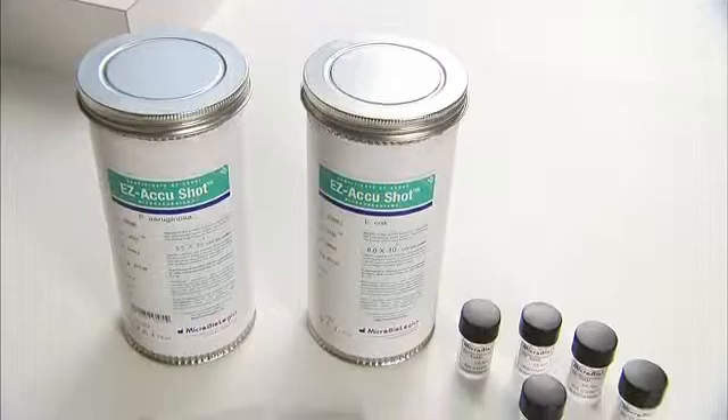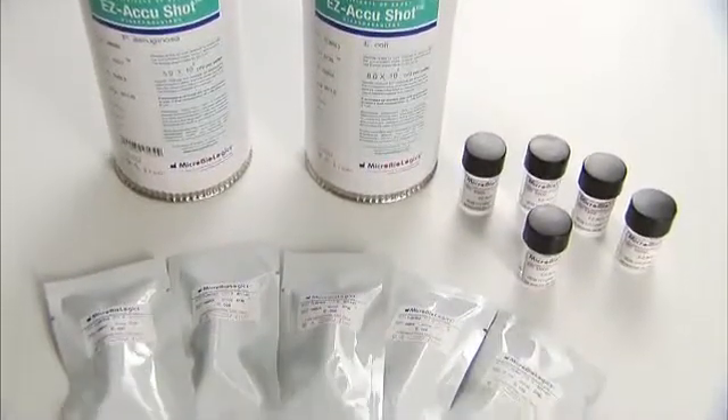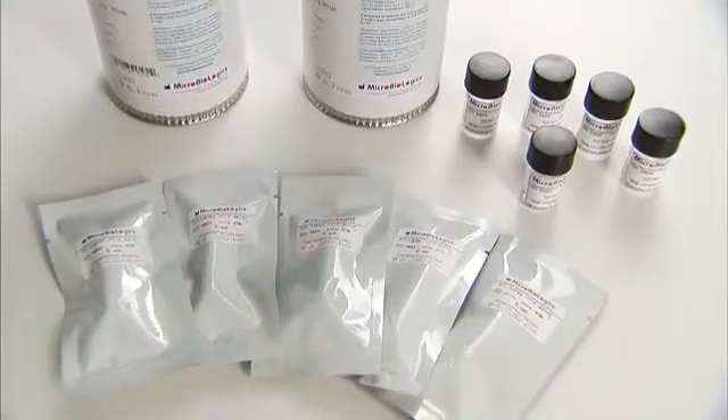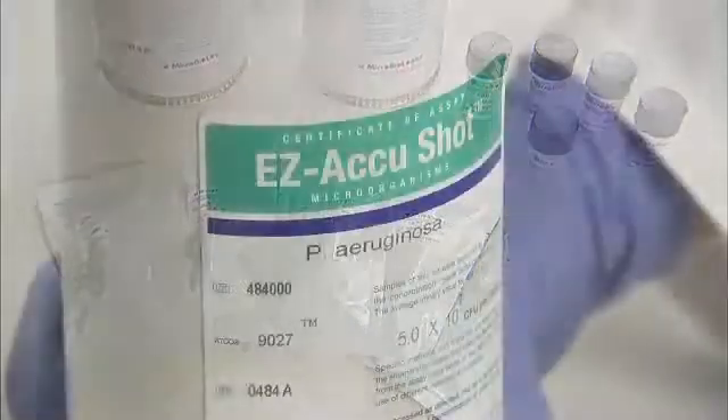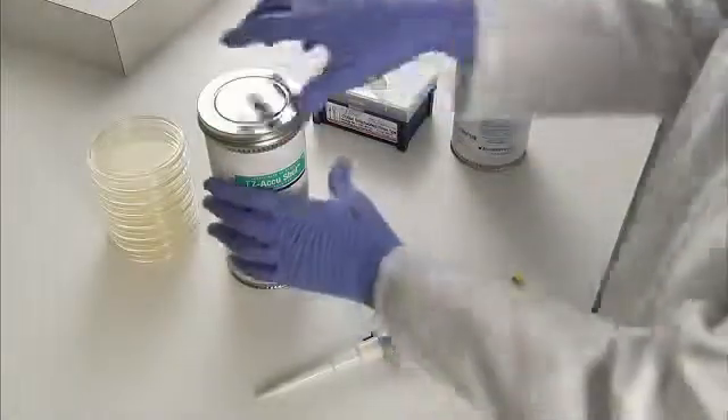Easy AccuShot includes 5 vials of quantitative microorganism with 1 lyophilized pellet in each vial, 5 vials of hydrating fluid, and a peel off certificate of assay for easy documentation.